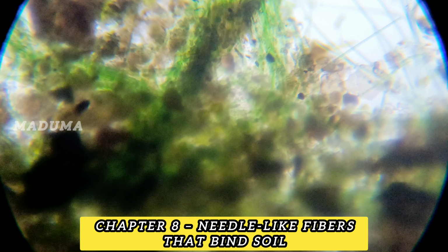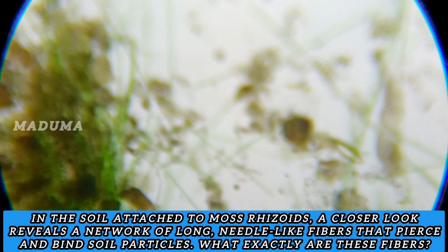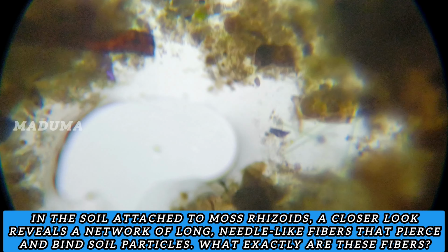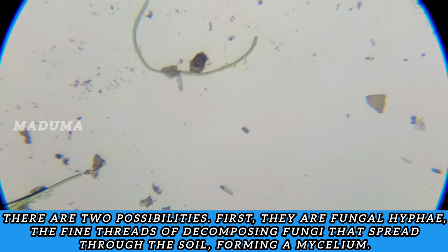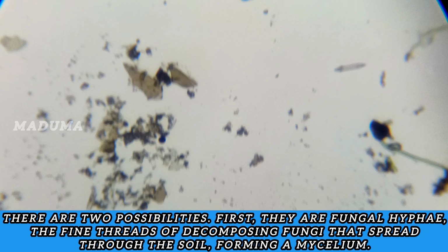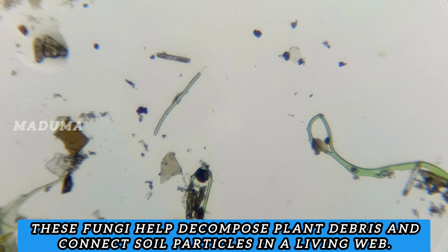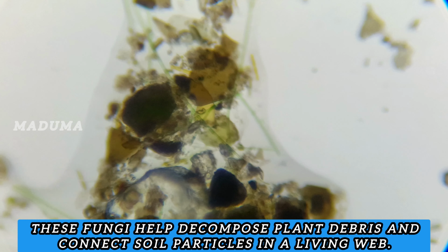Chapter 8. Needle-like fibers that bind soil. In the soil attached to moss rhizoids, a closer look reveals a network of long, needle-like fibers that pierce and bind soil particles. What exactly are these fibers? There are two possibilities. First, they are fungal hyphae, the fine threads of decomposing fungi that spread through the soil, forming a mycelium. These fungi help decompose plant debris and connect soil particles in a living web.